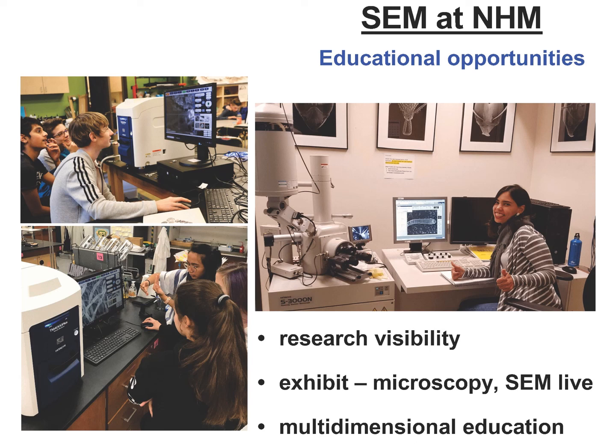An SEM on display and in operation in conjunction with an exhibit on the basics of microscopy will open a window into some of the important technologies used in many fields of science. And just as many schools are now offering hands-on experiences with SEMs, there are multidimensional education opportunities possible in a museum setting.